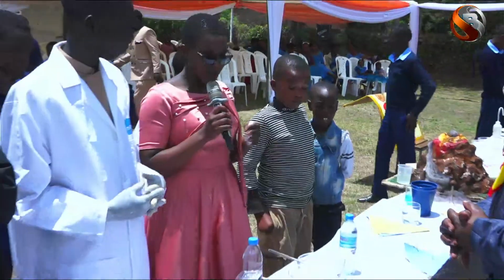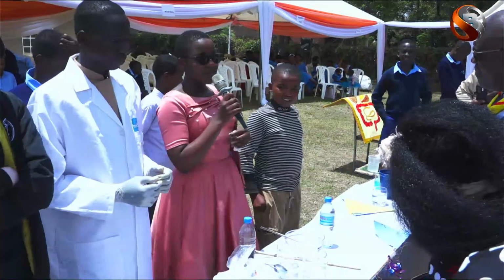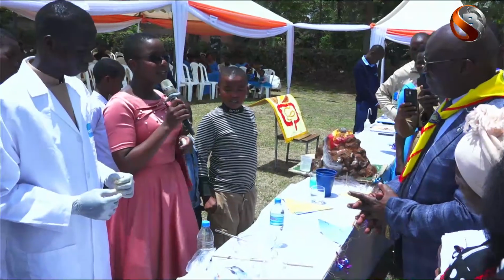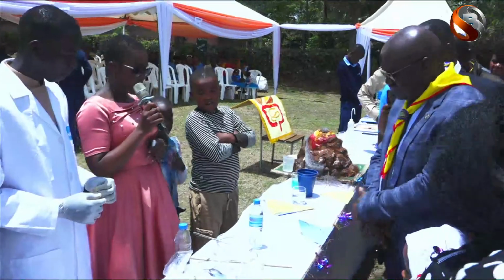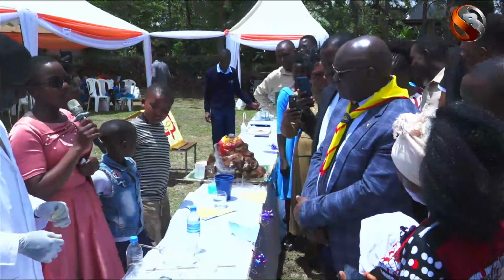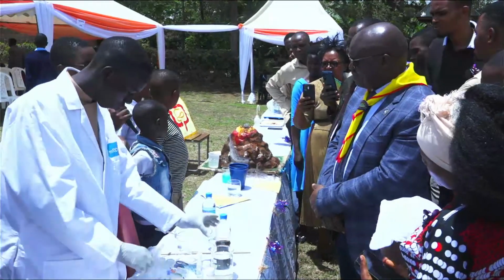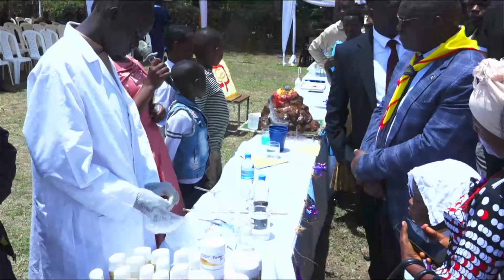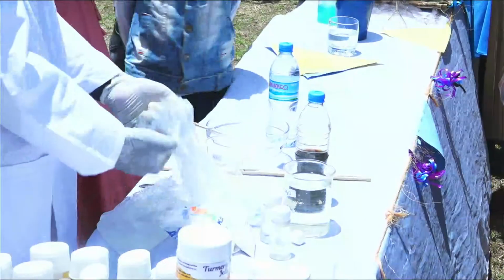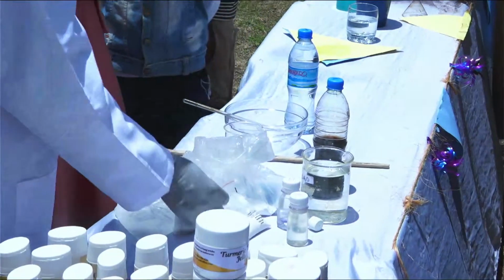Today we are going to explain to you how to make soap through a process called saponification. Saponification is a chemical reaction between fats or oil with a strong base, whereby the strong base can be sodium hydroxide or potassium hydroxide. Actually, there are two types of soaps: a hard soap, which is known as bar soap, and a soft soap, which is a liquid soap. Today we are going to explain how to make a liquid soap, whereby we use a strong base called potassium hydroxide.